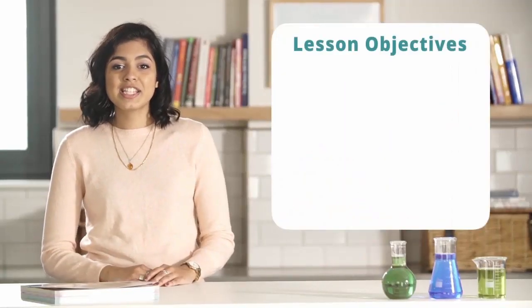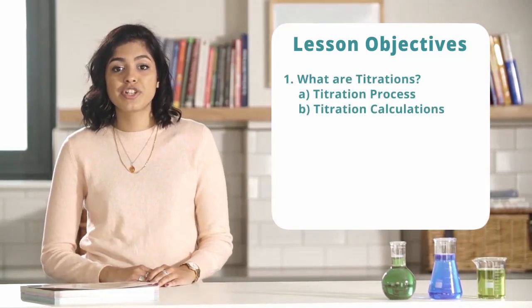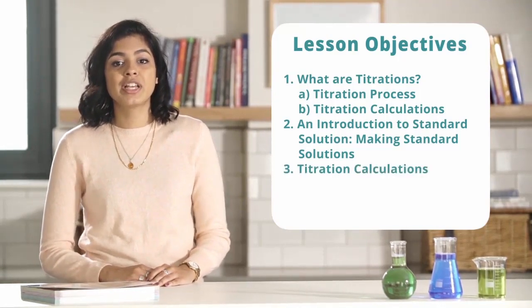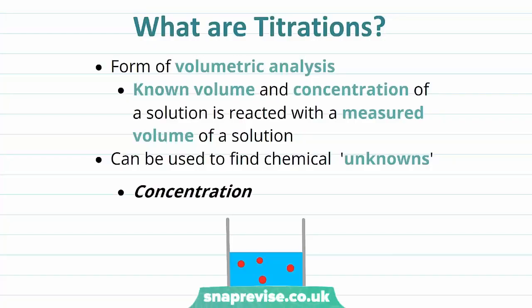Hi guys, in the next series of videos we're going to take a look at what titrations are, looking at the titration process, an introduction to standard solutions, looking at how we make standard solutions, titration calculations, an exam style question, and finally a summary. So let's have a look at what titrations are.